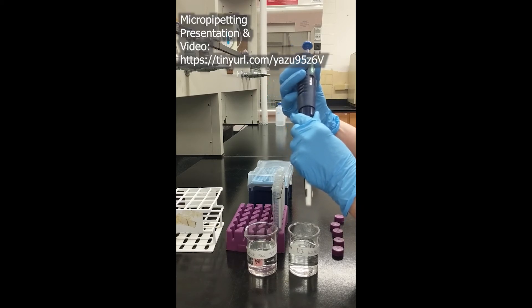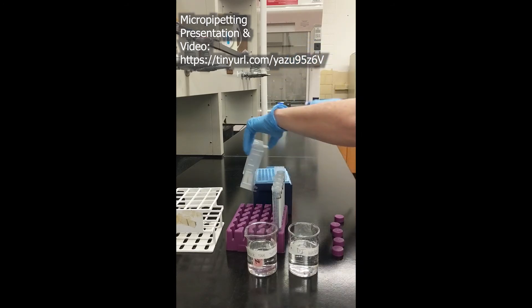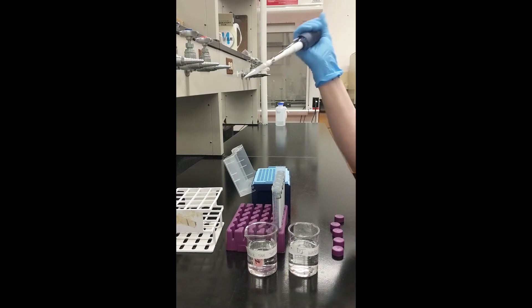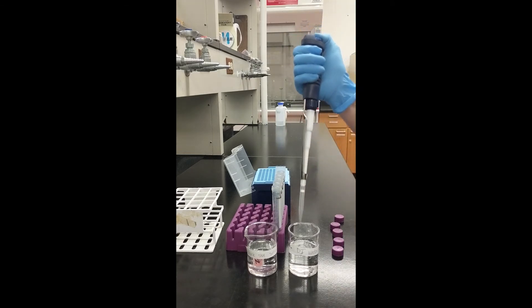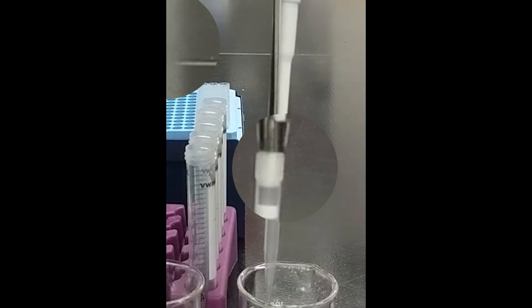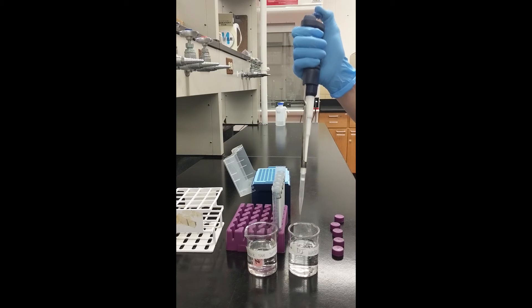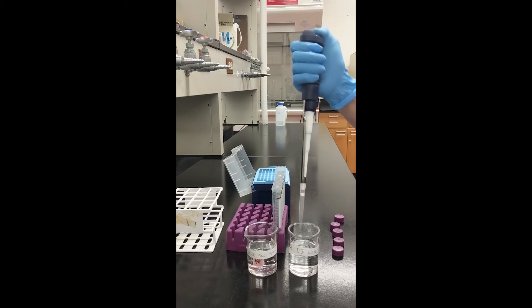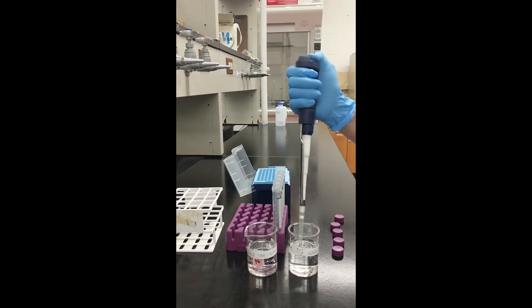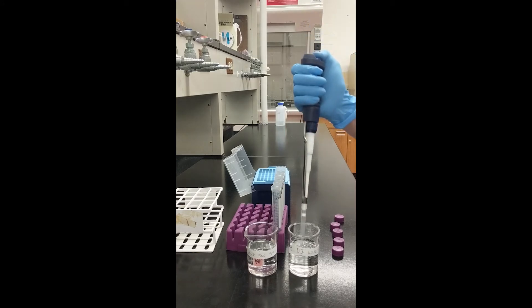Be sure to check out the video on micropipetting for a more detailed explanation on this technique. For this preparation, I'm using a 1000 microliter filter tip — you can see the filter inside of the pipette tip in this close-up. For this calibration standard preparation, I will be preparing the standards using serial dilutions, meaning diluting the standards using the previous standard solution. You will need to mix each calibration standard prior to drawing liquid with the micropipetter.